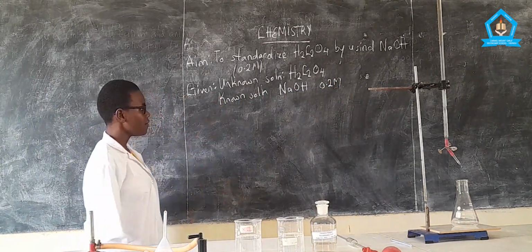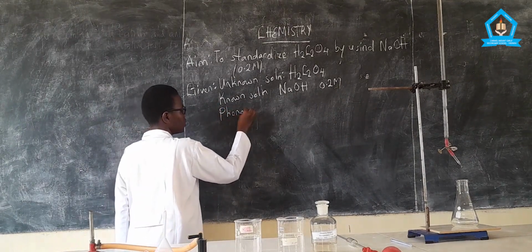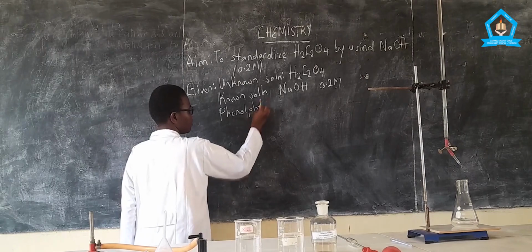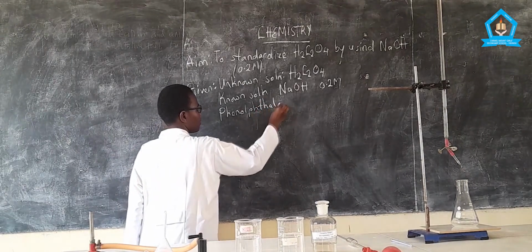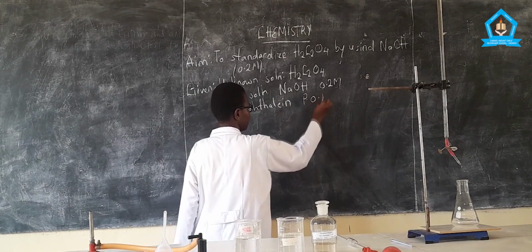And we also have phenolphthalein, which is our indicator today.